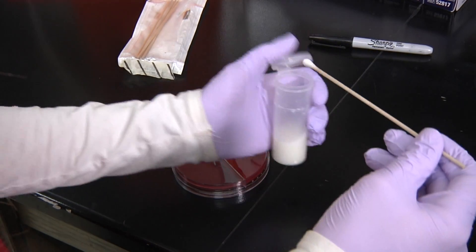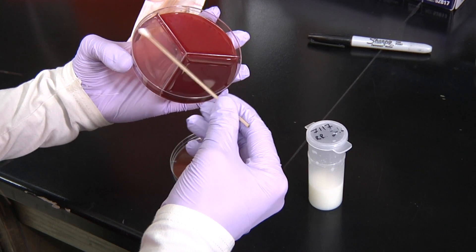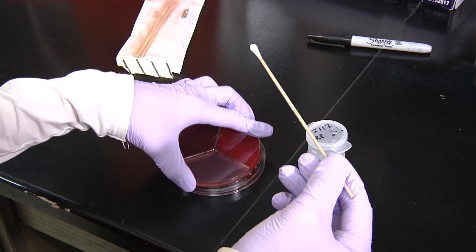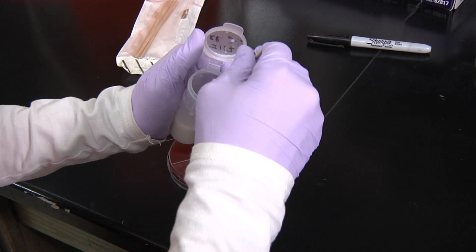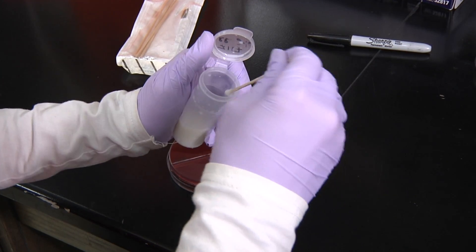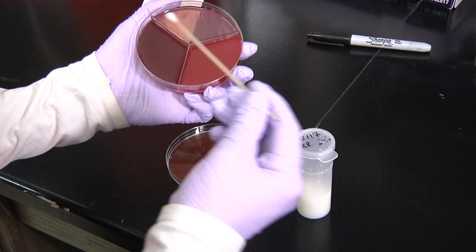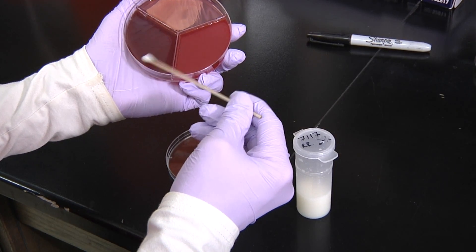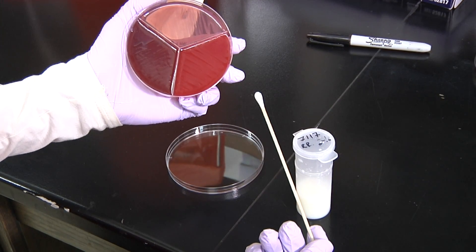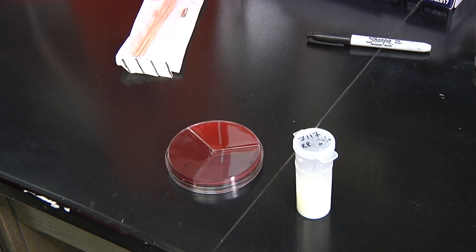Regardless of what type of plate you're using — a bi-plate, a tri-plate, or a quad-plate — every time we inoculate another segment of that plate, we'll dip the swab again, let the milk absorb, and repeat the process for each section separately. After each section of the plate is inoculated, we immediately cover the plate and lay it flat for about five to ten minutes to let the milk absorb into the media.